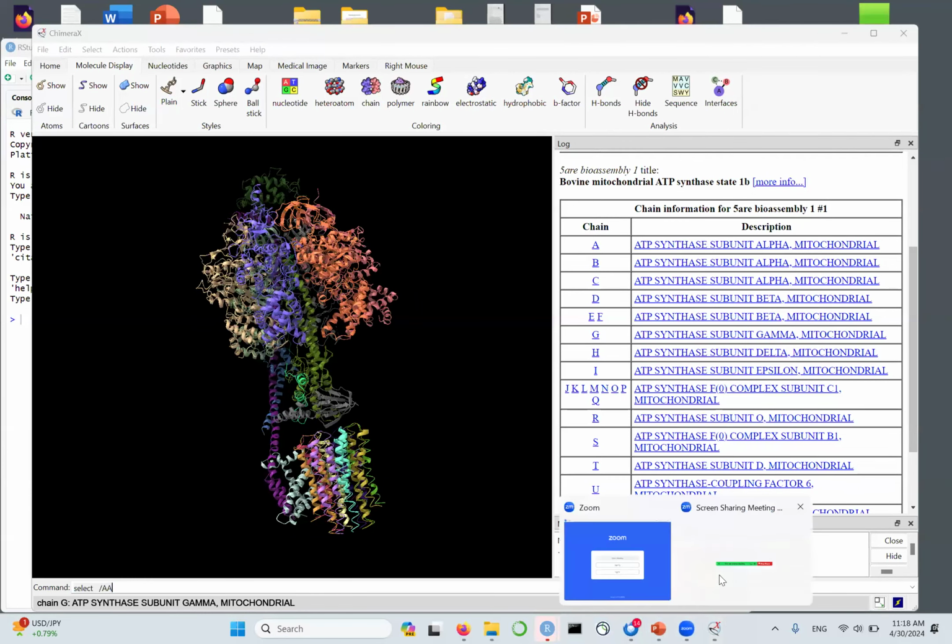So most of the glycines end up in here. At least a lot of them end up in there, and they are perfectly fine. This is one of the ways of evaluating the quality of the protein structure. If someone gives you a protein structure, you can generate a Ramachandran plot and then evaluate if the residues are showing up in a disallowed region. There are probably some problems with the quality of the structure because the residues physically shouldn't be there because it's not possible. It's just the model that's creating errors.